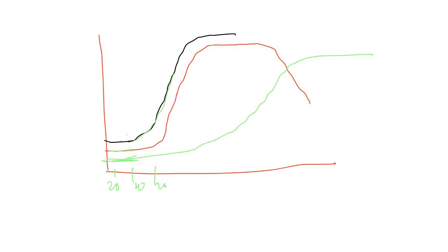This should not be a terribly hard lab, I think. Maybe the math is the worst, but it's not terribly difficult math, I hope. Try to get it down because it will be part of the practical. So count on dilution factors having to be calculated and CFUs per mL having to be calculated in the practical.